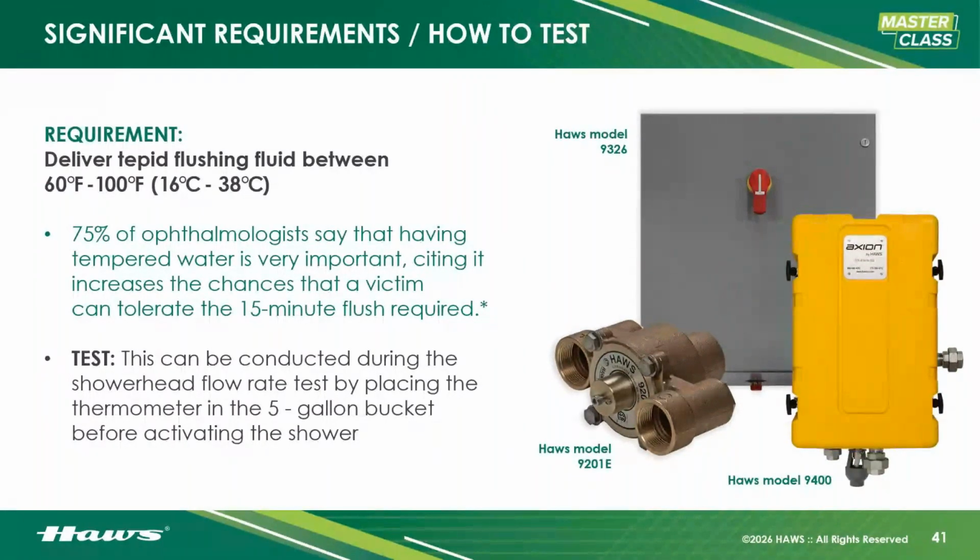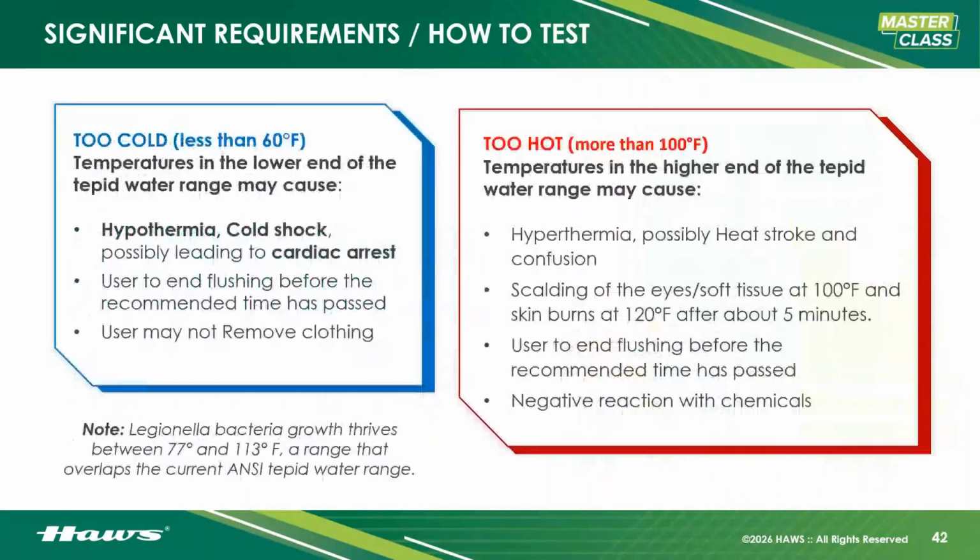And it's going to be cool enough that it'll be non-reactive with chemicals that may be volatile with hot water. Also, the hotter the water, the worse it is going to feel on what will potentially be open wounds. So having a comfortable water range will help the victim to stay in there. So look for equipment like you see here on the right, whether it's electric, instantaneous heaters, steam heaters, mixing valves, things of that nature. This is a very important part of the standard because if it is too hot, you're going to force them out.